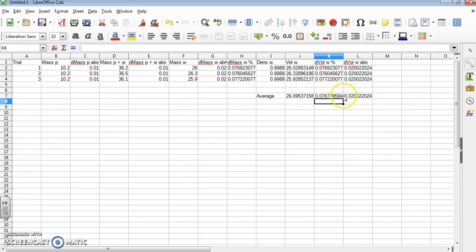Now the nice thing here would be I can, if I were to actually make a mistake here, let's say this one really wasn't 26.3, let's say it was 28, everything updates for me, and I don't have to worry about redoing the whole thing. Okay, now let's go back to 26.3. I'll change back. So I believe that is all we need for part 1. And I will stop and create a different one for part 2.